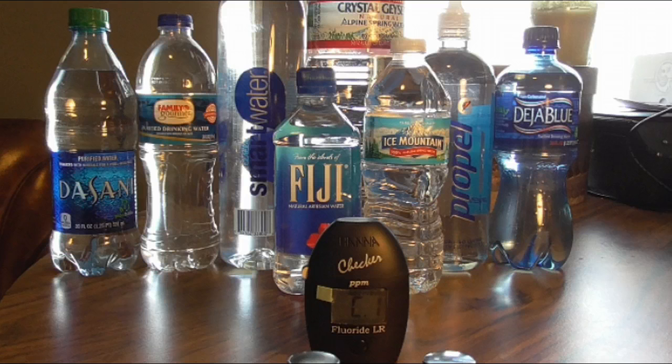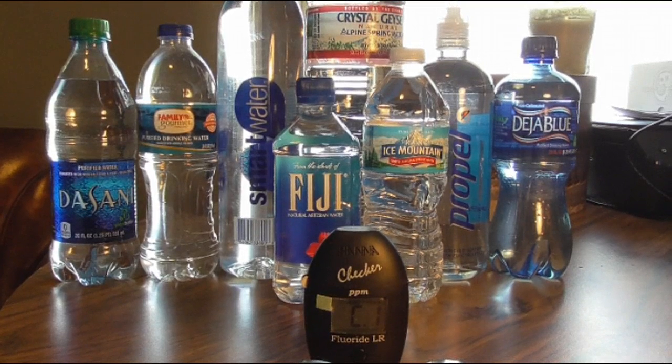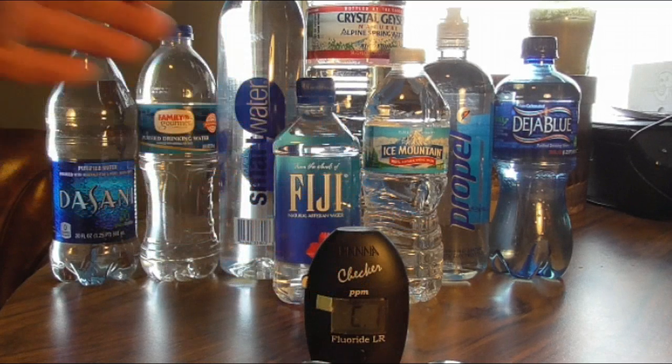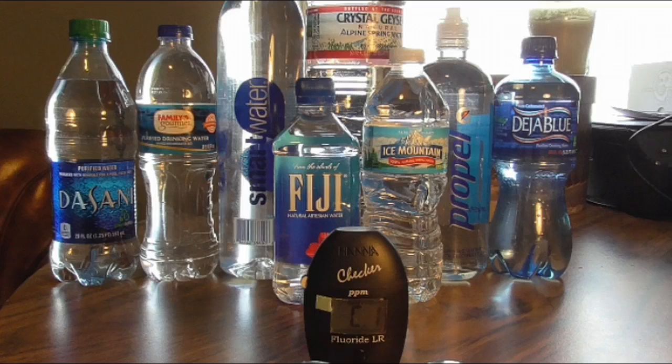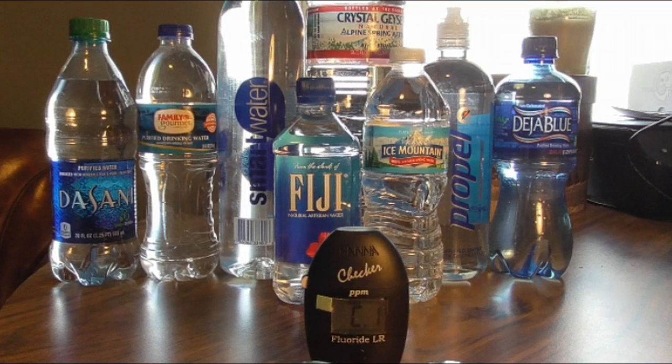There were recently questions as to the levels of fluoride in each of these drinks. So what I've done is I've put out a separate video in regards to this checker that you guys can watch and get a lot of information on. I talk about the calibration, the region, the extra test region that you'll need, and you'll need deionized water or distilled water.